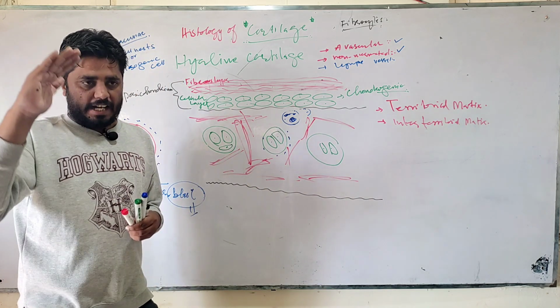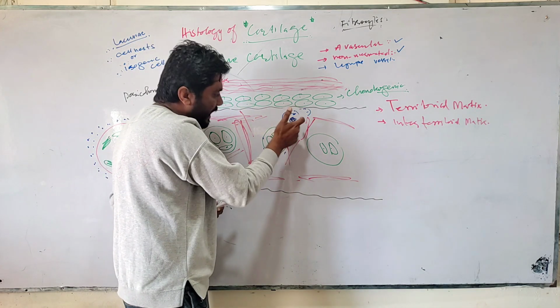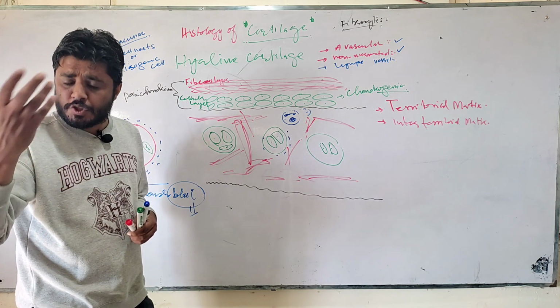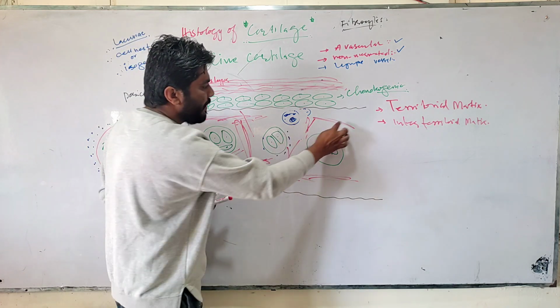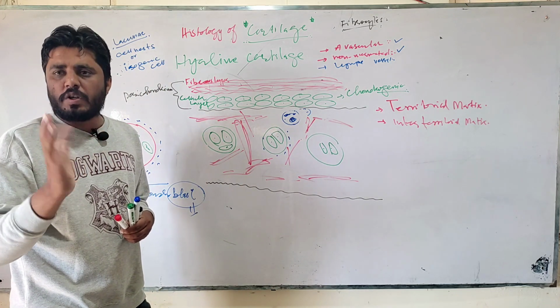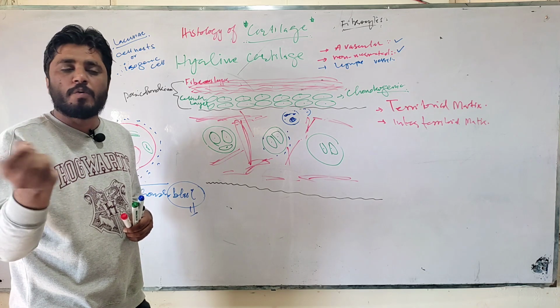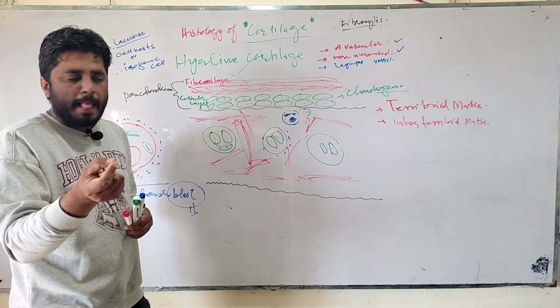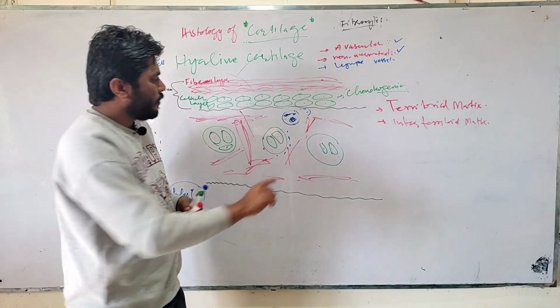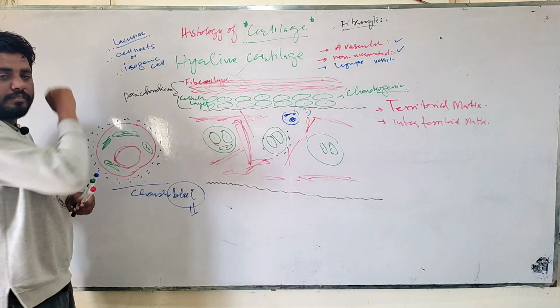A blank area around this cell. This is a general term. It applies to any other tissue also. You may find some area is blank, white. There is no color. In a histology slide you mostly have color. If you are doing H&E, you will find blue and red color commonly. So this area will be blank or white, and this blank or white area is known as lacuna.